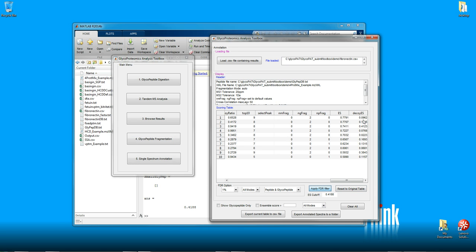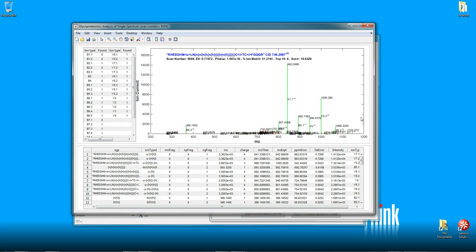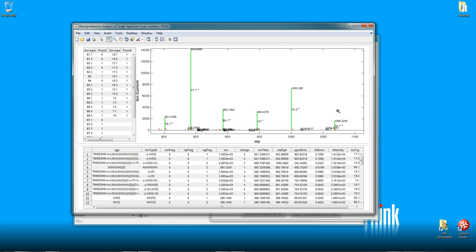To view the resulting spectrum, click on the corresponding row. This results in the program reading the input MZXML file, reanalyzing and scoring the file again, and finally displaying the experimental data with matched peaks shown in green and unmatched peaks shown in red. Zoom in to a particular portion to view these peaks more closely. You can see the exact masses of the peaks and also the nature of the fragmentation based on the conventional b/y nomenclature.